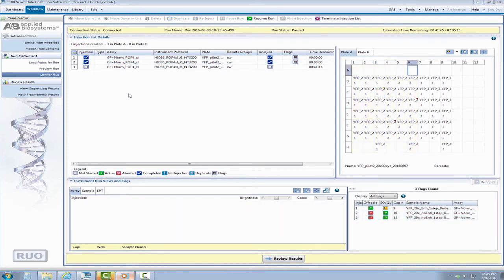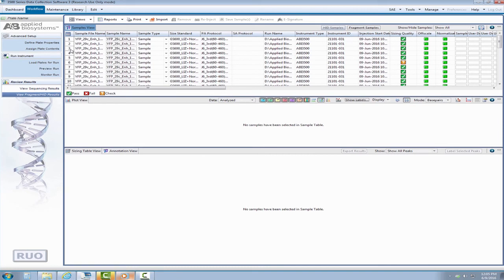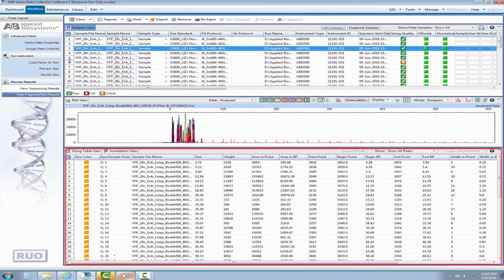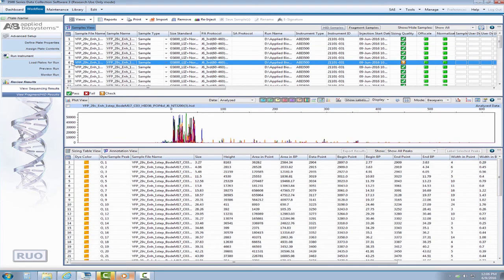The final location to perform a reinjection is in the view fragment HID results screen. In this screen, the samples have gone through a primary analysis giving you electropherogram data and flags to review and assess overall injection quality. To reinject from this screen, simply highlight the necessary sample or samples and click the reinject button located at the top of the toolbar.